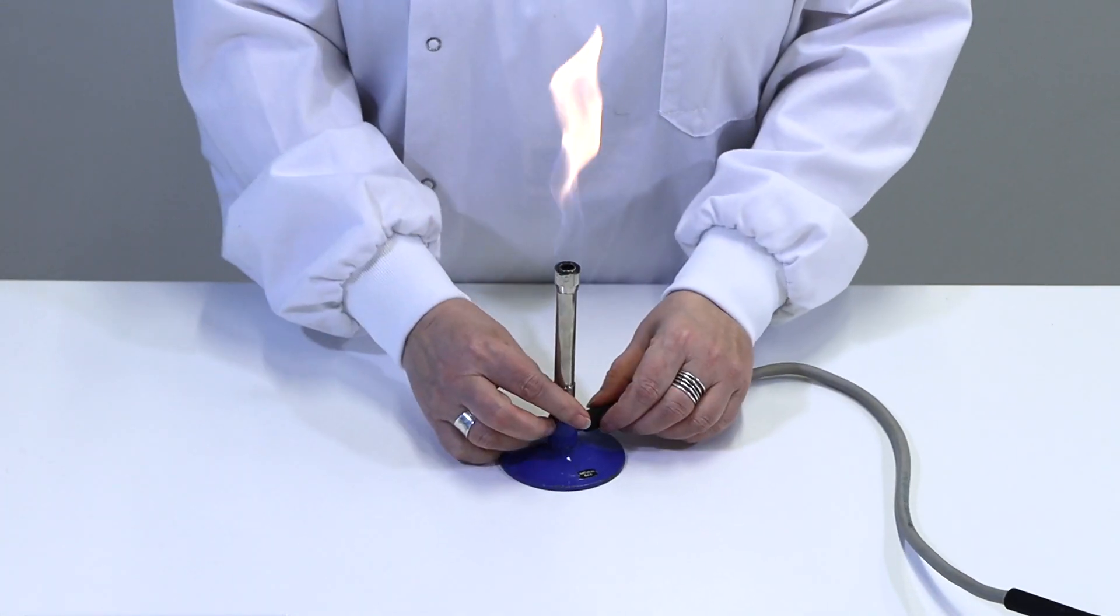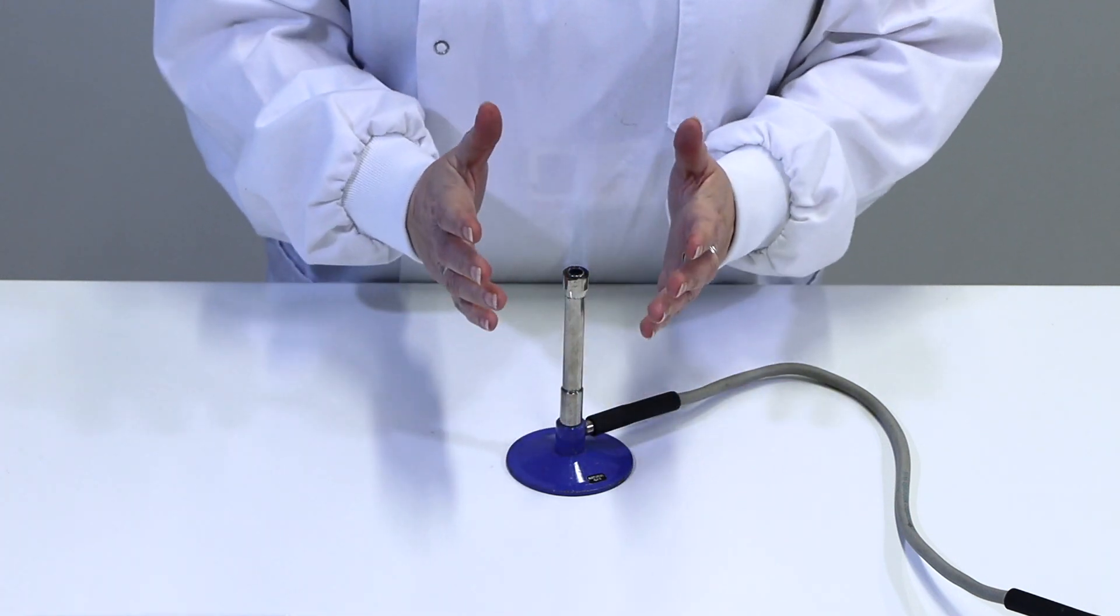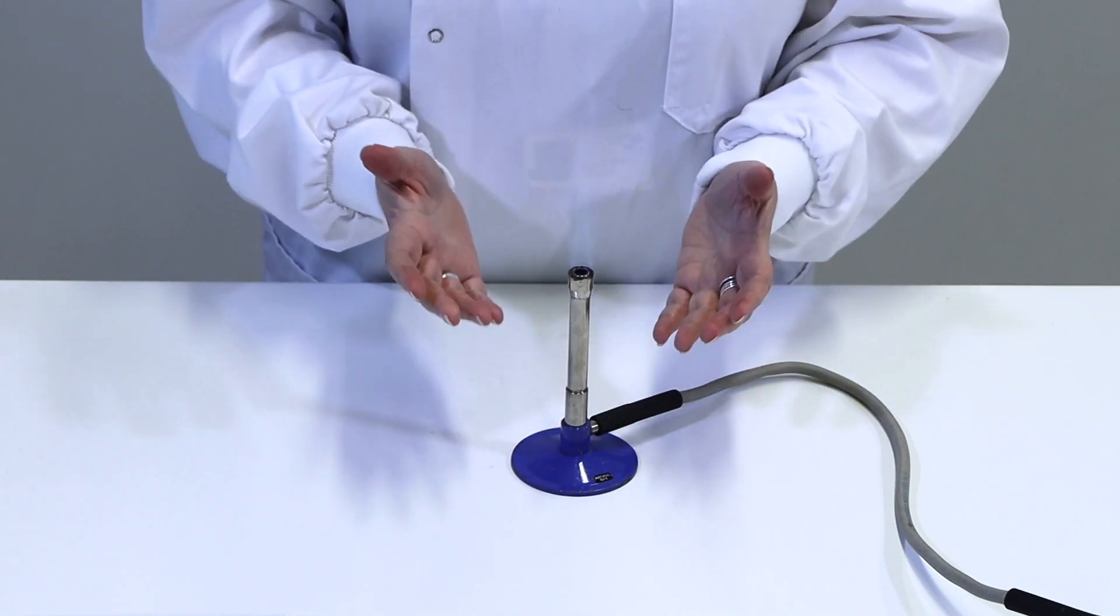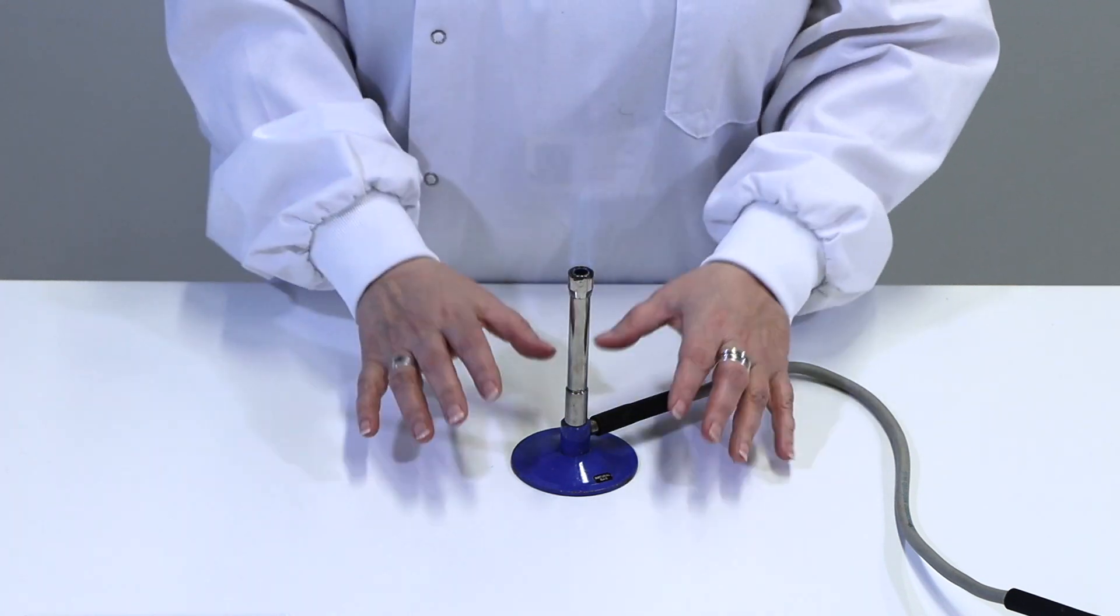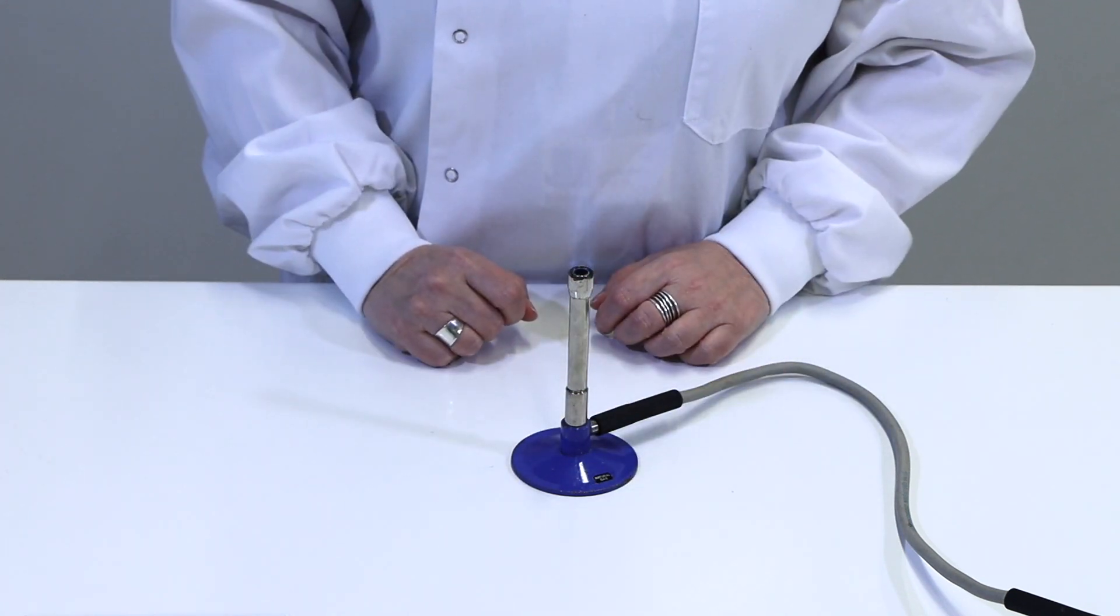So hot air rising if you put it on a full strength blue flame will be enough to make sure that microbes rise up and away from your experiment rather than into it causing contamination.